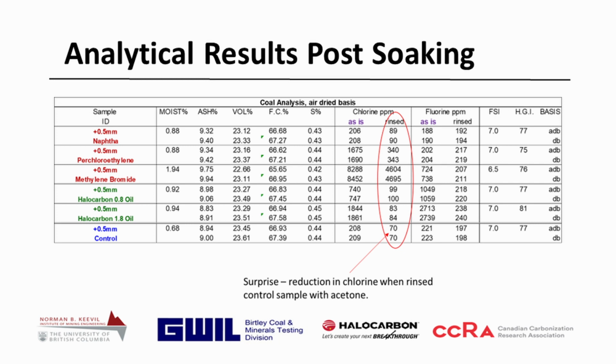We were very surprised on the chlorine side that, if you look at the very bottom here for the control sample in chlorine, not only did it take the chlorine out of the fluid, it was taking chlorine out of the coal itself, which was totally unexpected. So we were surprised by that, and we are going to continue to look at that and do further testing on it. But yeah, again, very surprised with that.